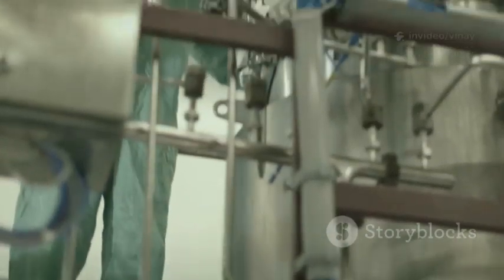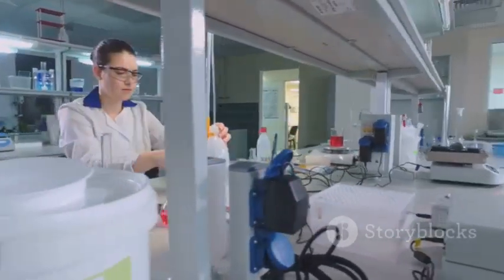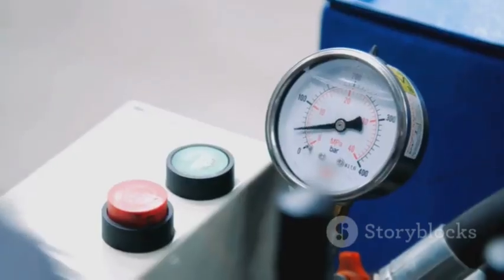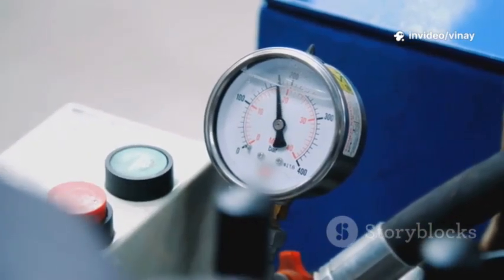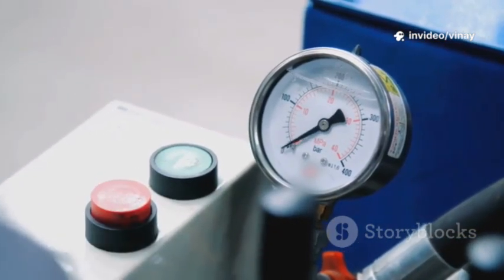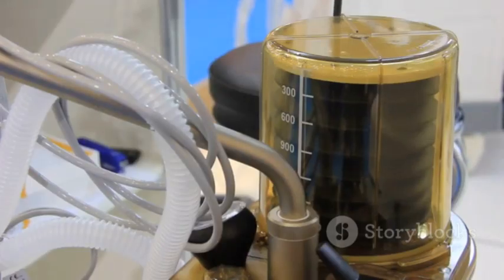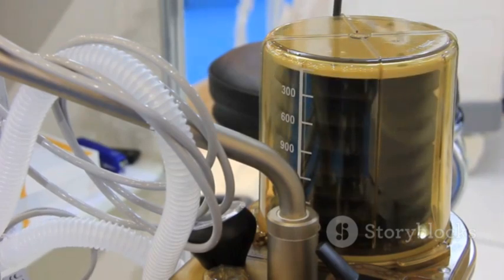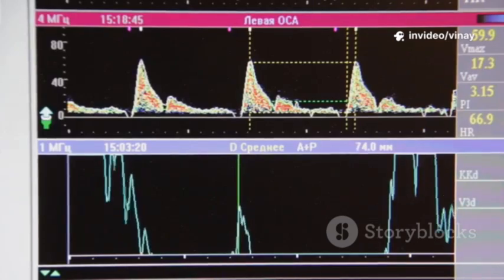The term diffusion test is sometimes used specifically when testing smaller filter systems, like those used in a laboratory or for small-scale production. In these smaller systems, the total amount of gas that moves through the filter by diffusion is very, very small. The flow rates are tiny, because the flow is almost purely diffusive, and the contribution from any potential bulk flow through the pores is negligible for an intact filter. The name diffusion test is a very accurate description of what is being measured.